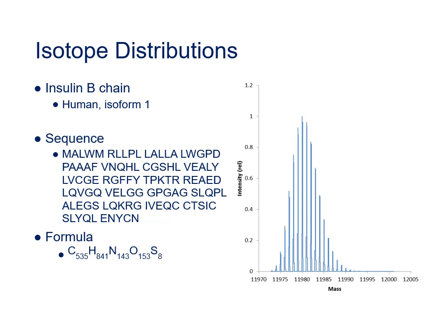So now let's jump back to this slide so we can use it to go through some common definitions of specific features in isotopic distributions.